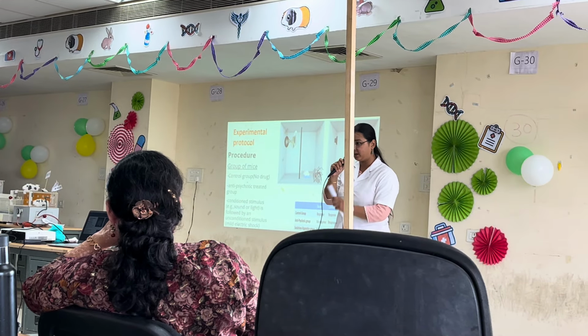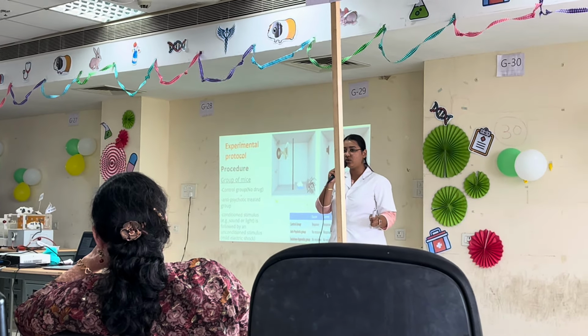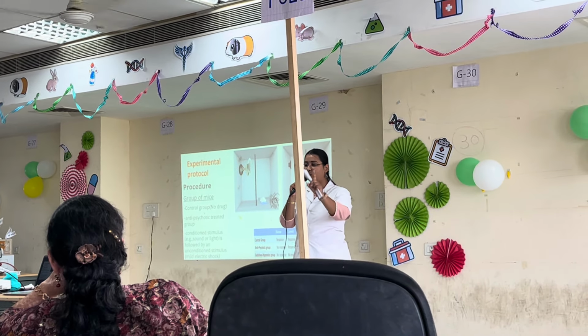Now, for the 4th part of the training phase, we are going to have a conditioned response, wherein the mouse without current is going to climb the pole.